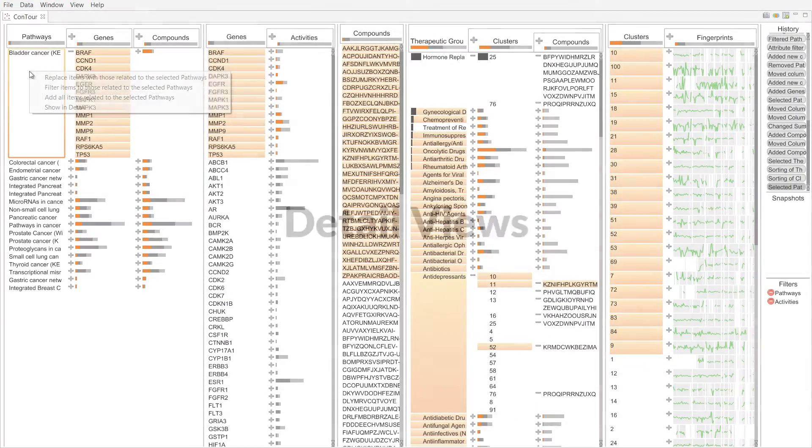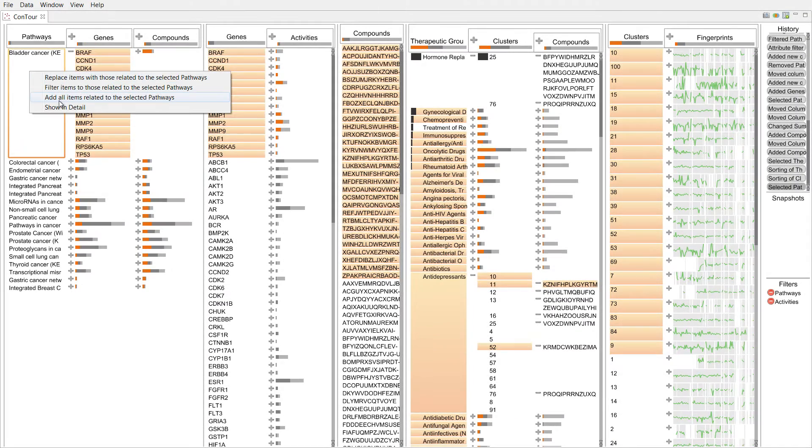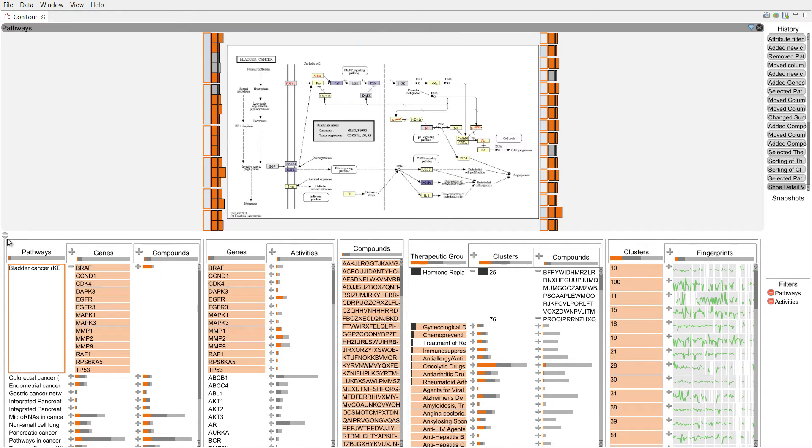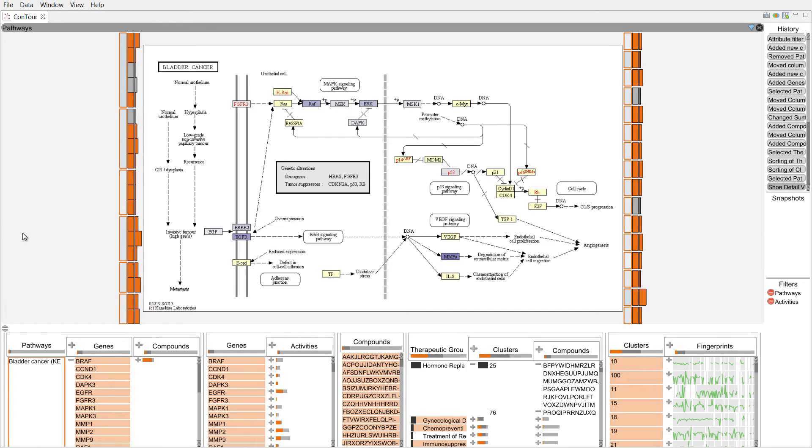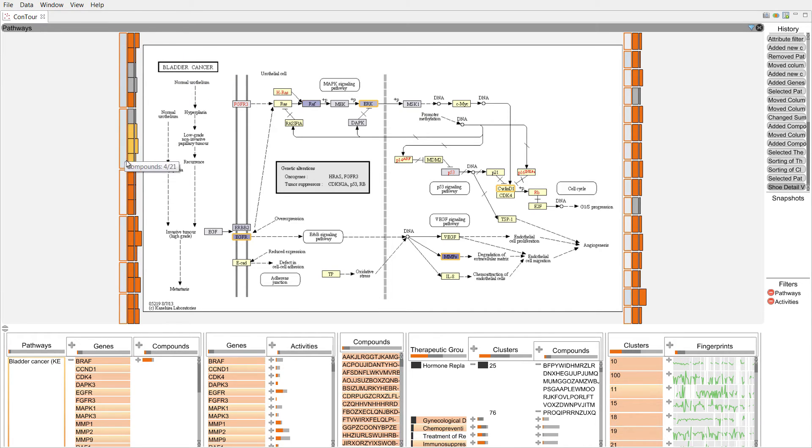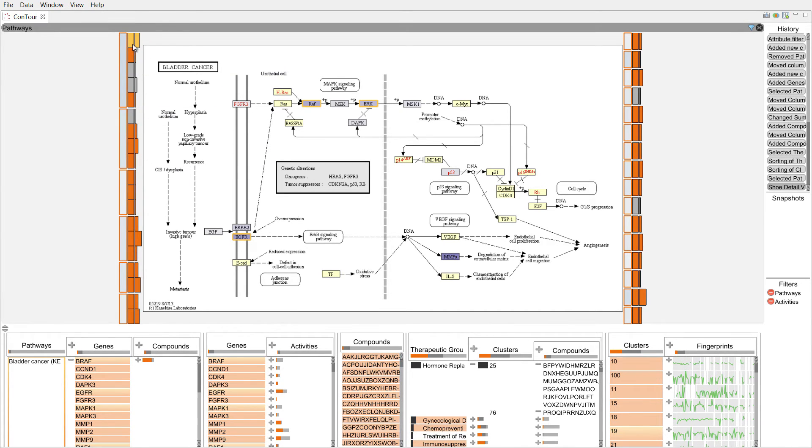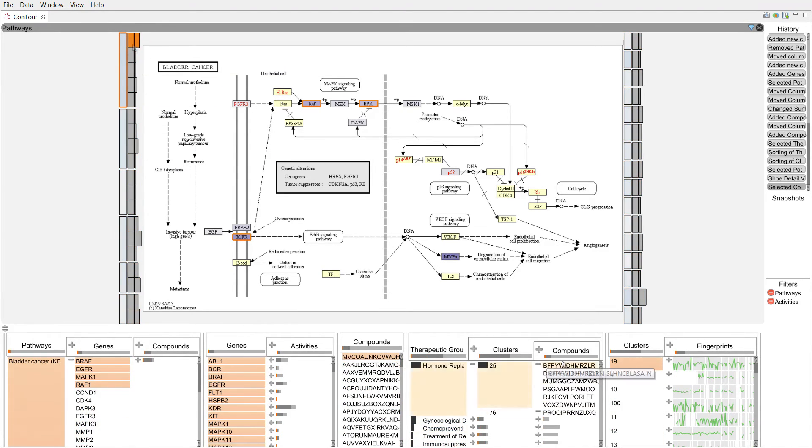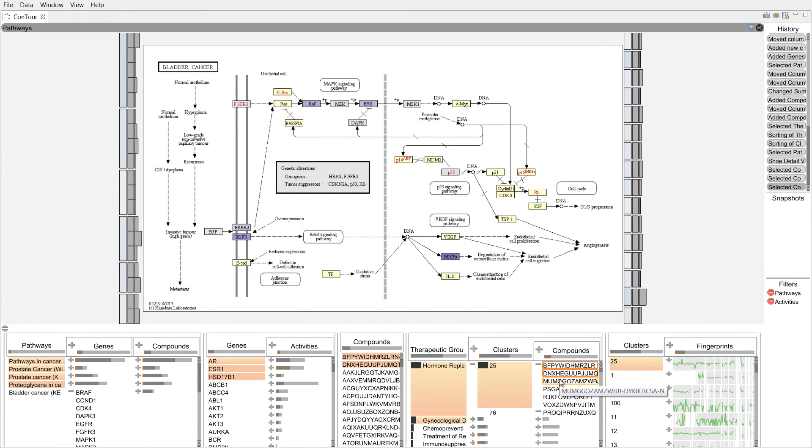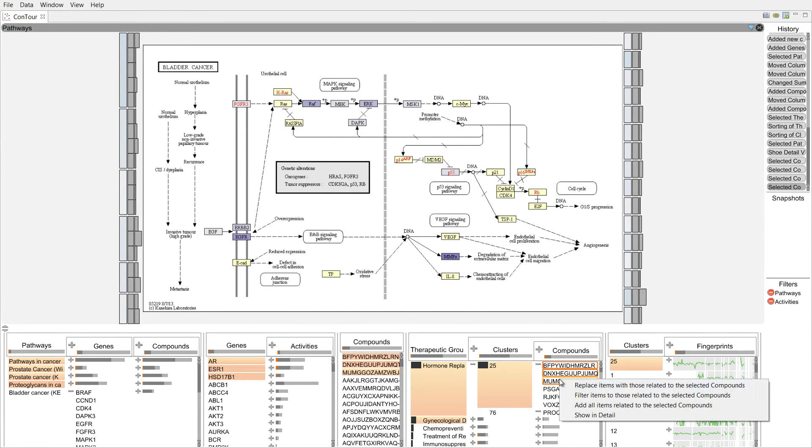Once we've found an interesting item, we can look at its details. The pathway detail view shows the whole pathway graph together with boxes representing mapping compounds and clusters. We can also look at the chemical structure of compounds.